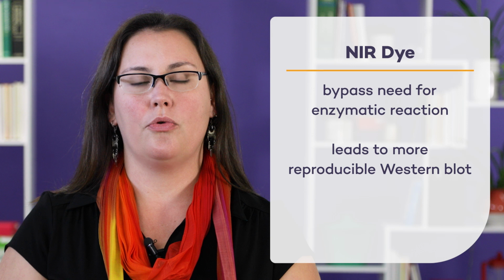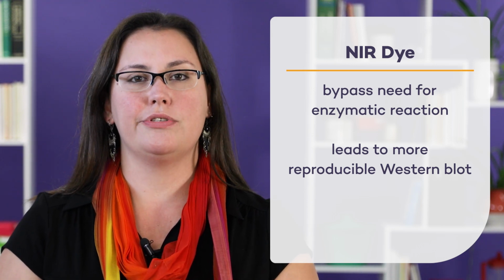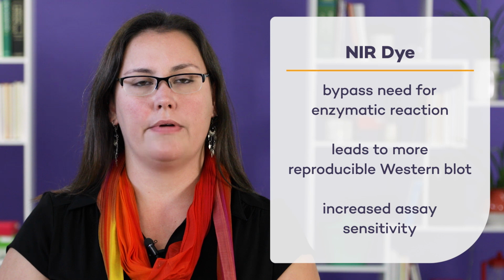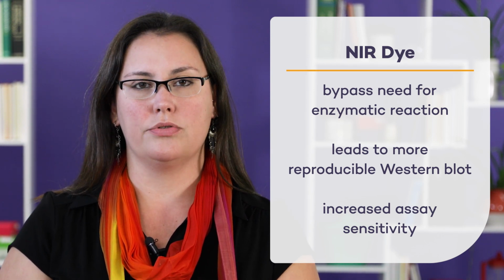Skipping the use of a substrate will bypass the enzymatic reaction between HRP and its substrate, which leads to a more reproducible Western blot. In addition to that, if you choose to use a near-infrared fluorescent dye, you're also going to increase the sensitivity of your assay due to the lower autofluorescence that comes from both PVDF and nitrocellulose membranes on those wavelengths. To learn more about the different chemistries that you can choose to use on your Western blot protocol, please refer to our previous Lambda U courses.